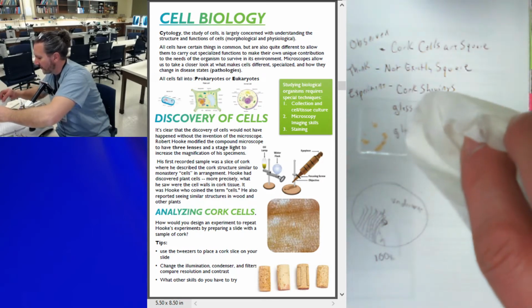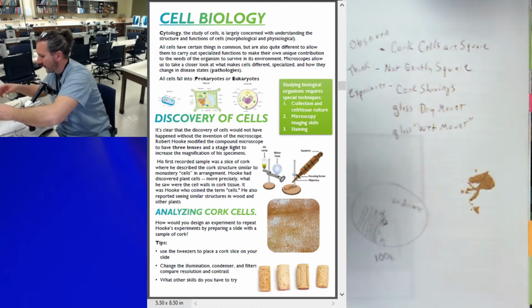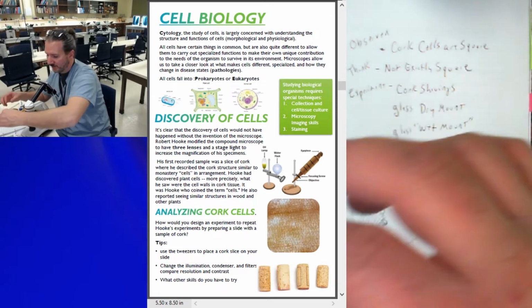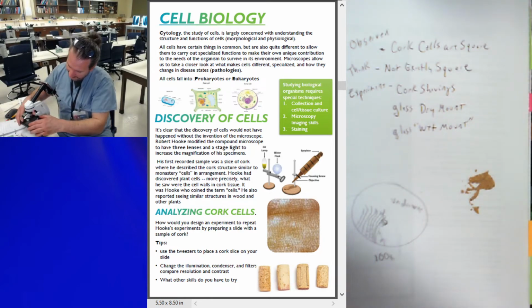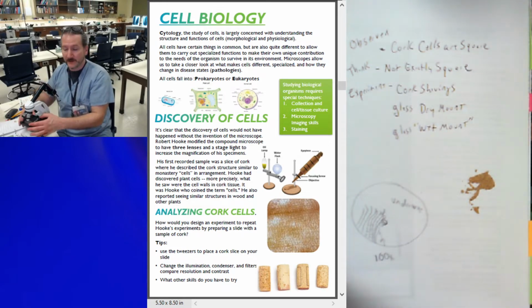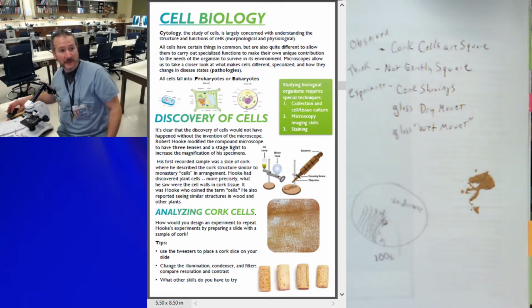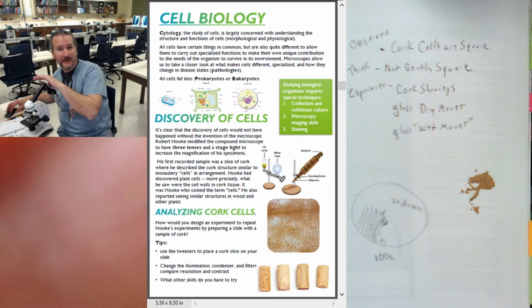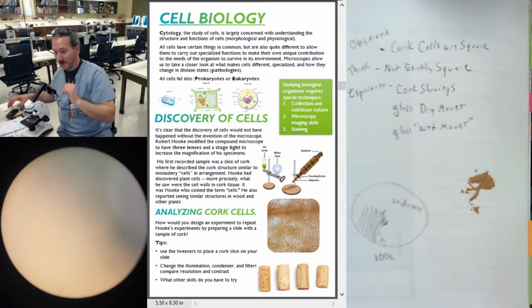And if it dripped off the edge, I would just take a paper towel, tissue paper, whatever, and clean the edge off. So I have some cells. My goal is the same. I'm bringing my stage down. Thumbs popping up the stage clips. I'm going to center that really nice one right here. See it. Right. I'm going to turn on my camera again because it likes to shut off on me. Boop. I don't want to see my face up that close. There we are. Okay.